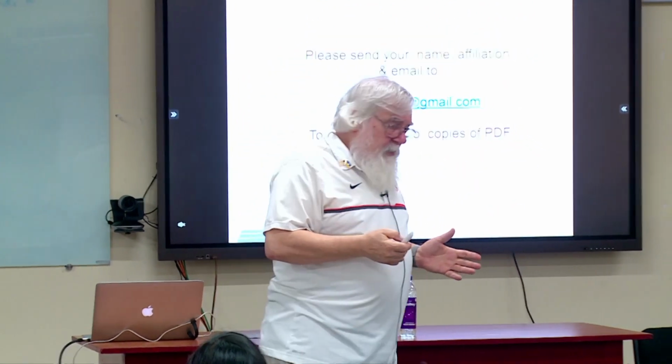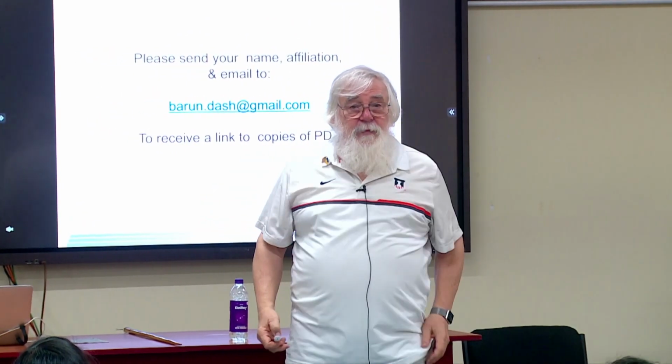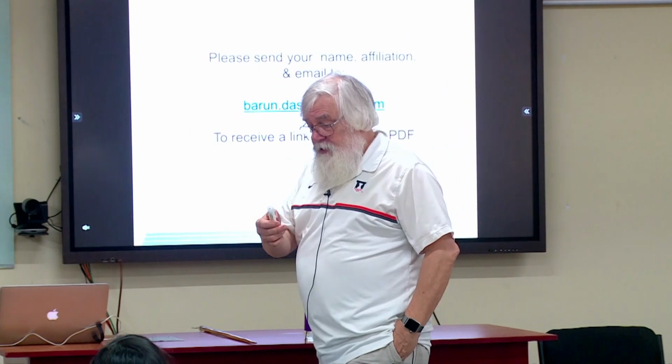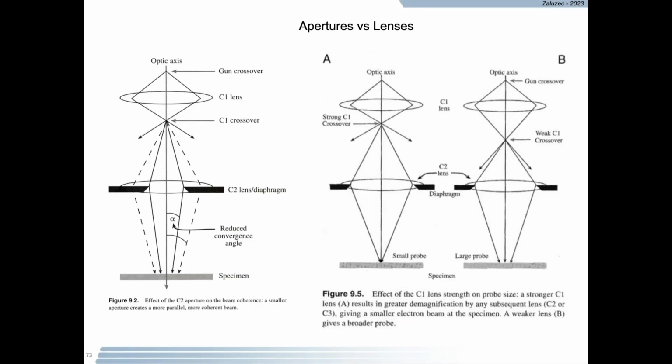Okay, and for those of you that do photography, you know you have apertures in your cameras. Well, we have apertures in the microscope too. We're going to talk a little bit about the role of the apertures because it's important to understand how the apertures affect things.